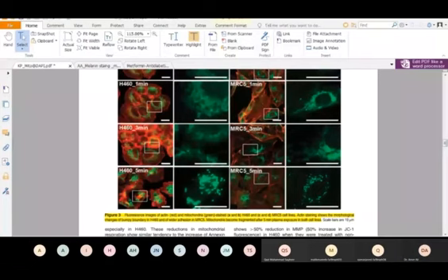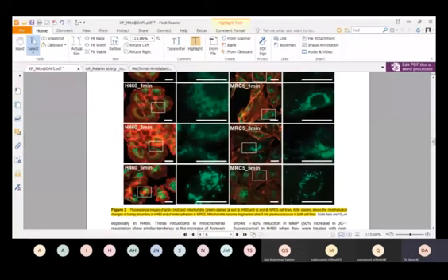Okay, students, let's extend our discussion of cell staining. Today we will discuss further the cell staining and tissue staining, and I will show you some publication where the cell staining and tissue staining data is reported. So you can learn how this staining data can be presented and can be used for the publication. Of course, that is one of the main goals of your research.